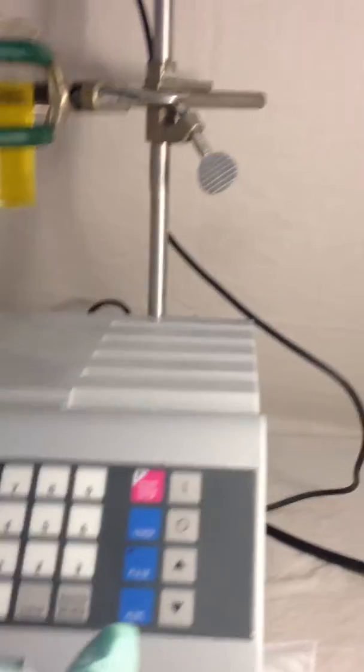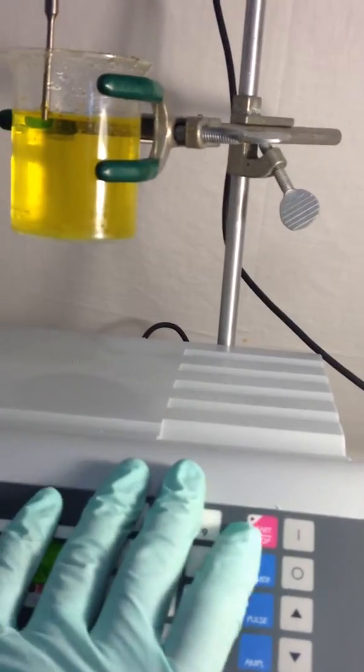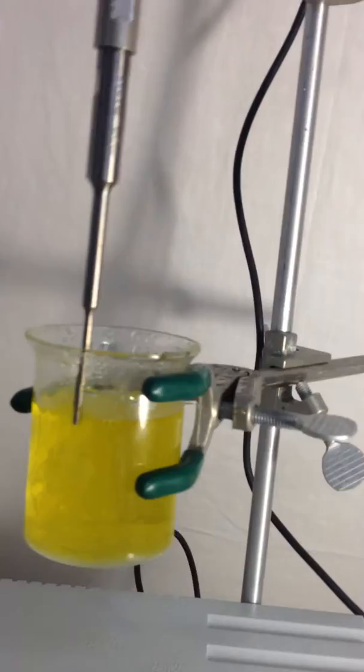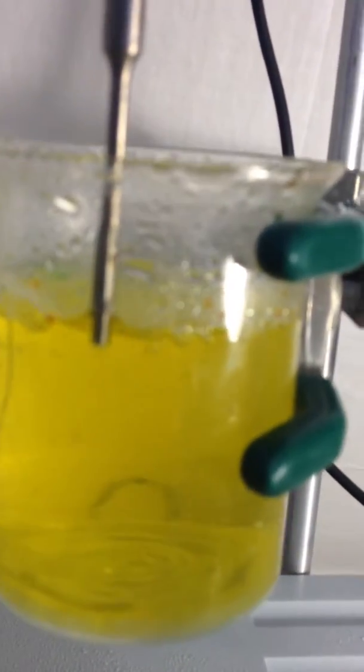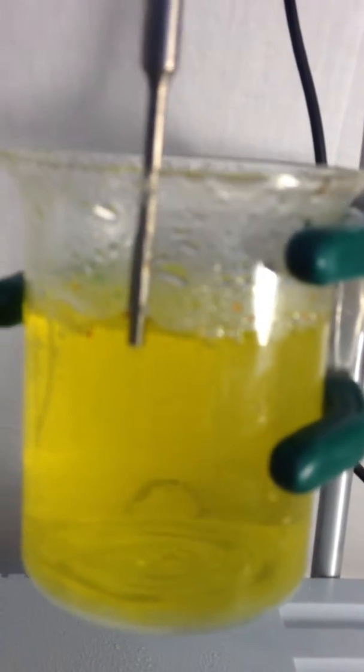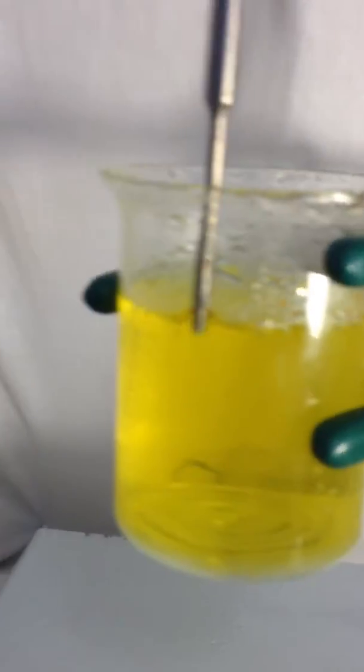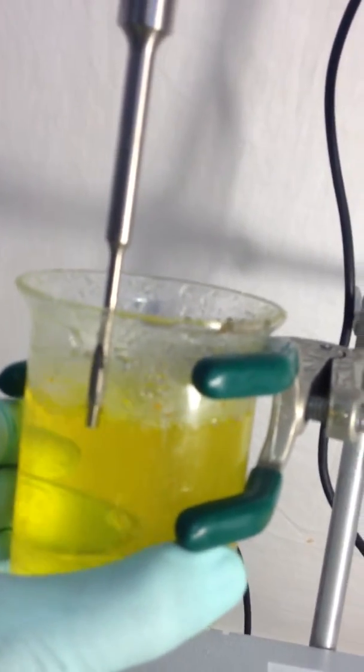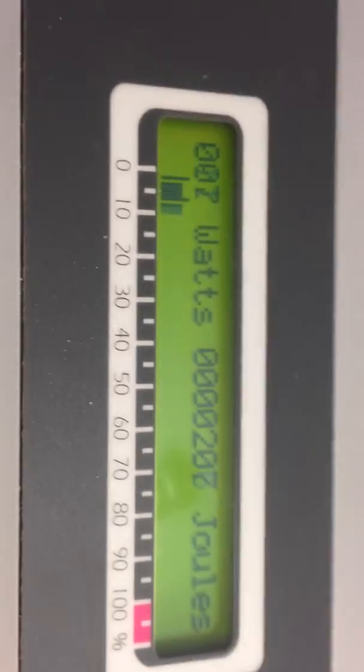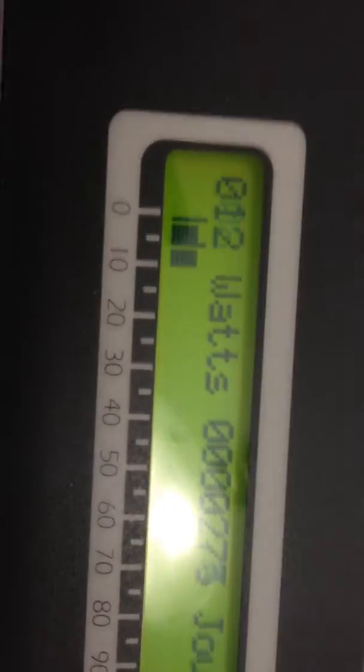As soon as you reach the bottom, you can see the vibration. That shows the rust that consumes. Obviously, if this goes, the water is just going to consume more power.